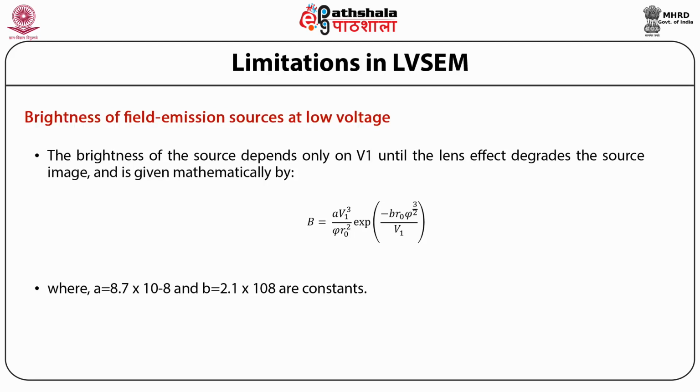Most field emission sources utilize a double anode design with V1 in the range 3 to 7 kilovolt, and it is used to adjust the beam current. A second supply between the ground and the cathode adjusts the primary beam voltage V0 to the desired level and reduces it for low voltage SEM, producing an electrostatic lens.